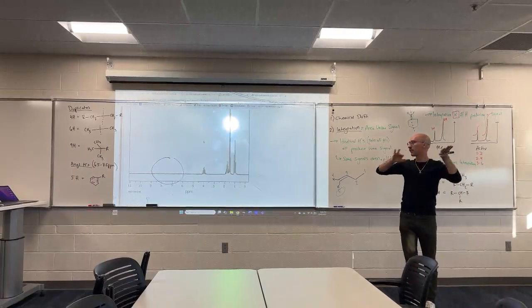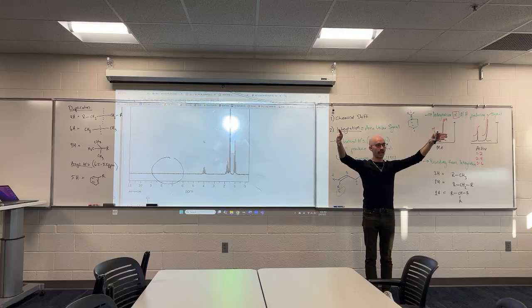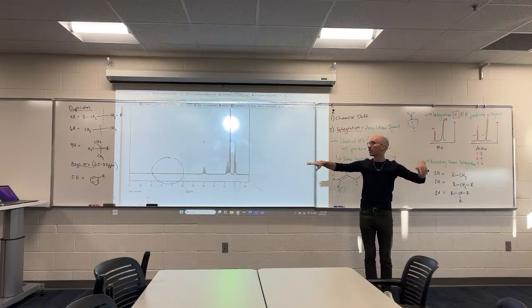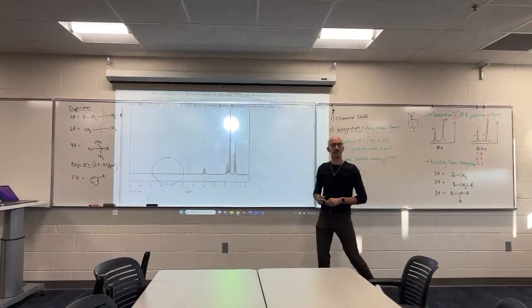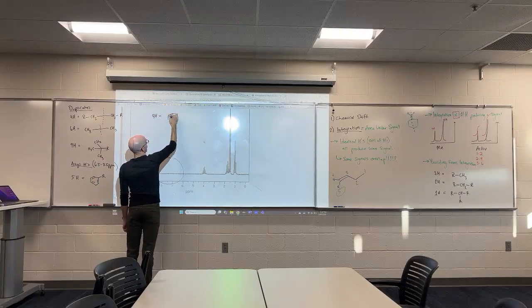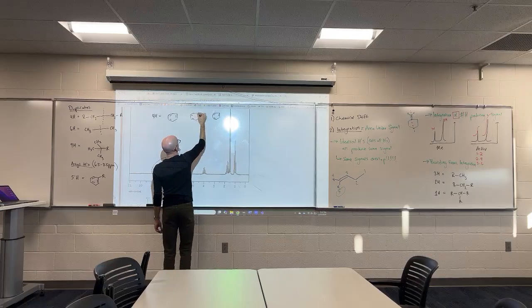Which is why I'm not going to give you aromatic regions where each peak in the aromatic is integrated on its own, but I'm going to integrate the aromatic region. So if the entire aromatic region integrates to 5, regardless of how many signals that is, that means you've just got a mono-substituted aromatic ring. If the integration in the aromatic region integrates to 4H, there are actually a number of different things that can be happening here.